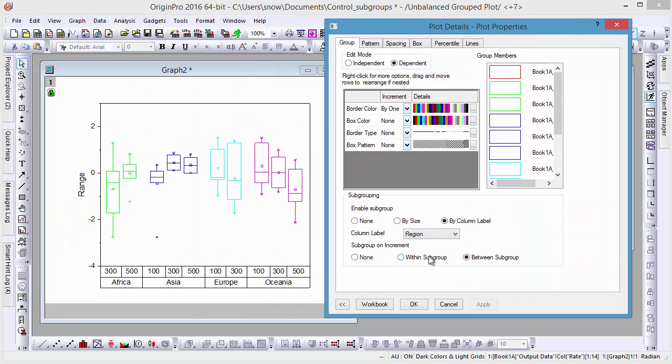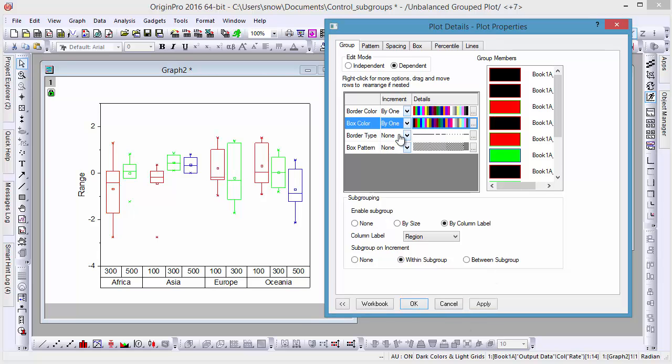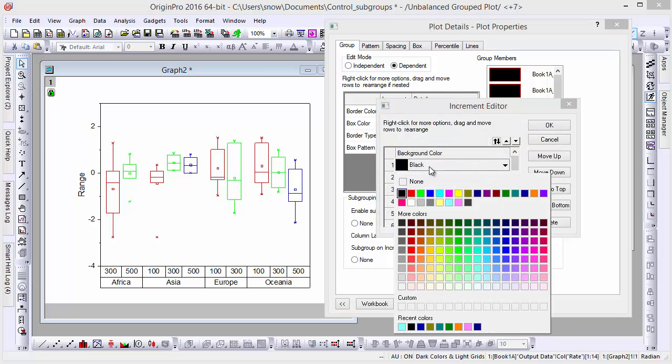By default, box plots have no fill color, so we need to set box color by one so that it can be controlled by a subgroup. Click the Ellipses button to define your color increment list.